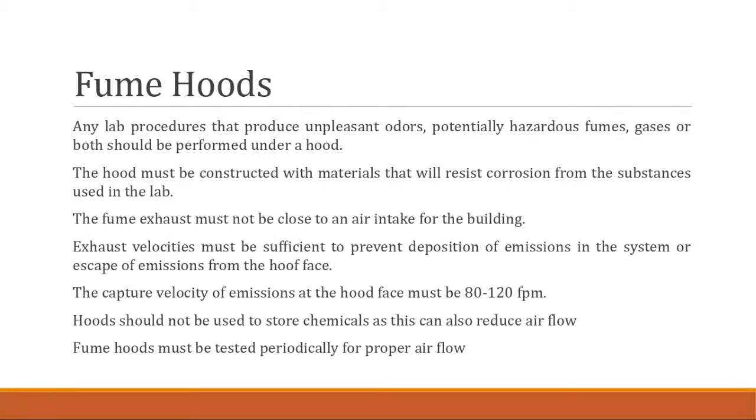So your hood's obviously constructed with material that'll be able to resist corrosion, because just because you're not spilling acid in a fume hood does not mean that it does not corrode on the inside. Vapors and fumes can be just as corrosive. Obviously, you're not going to have the exhaust be close to an intake of air for the building. Otherwise, you will be poisoning everybody else in the building as well.